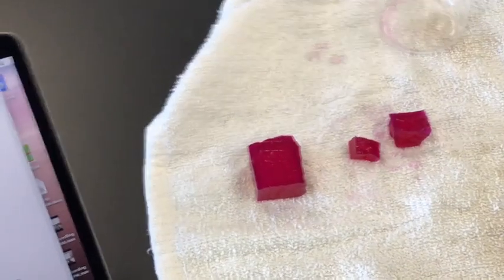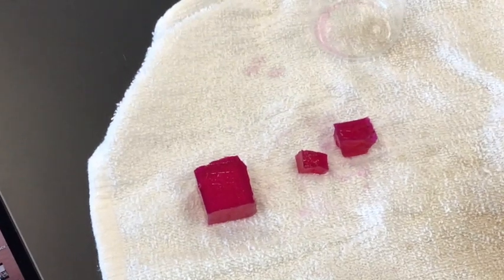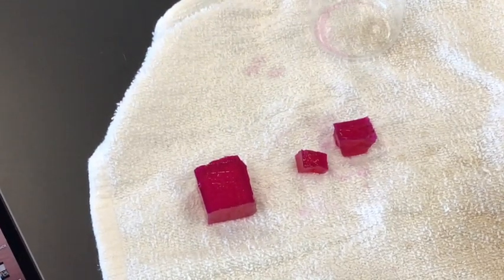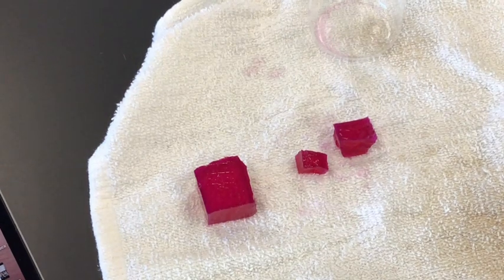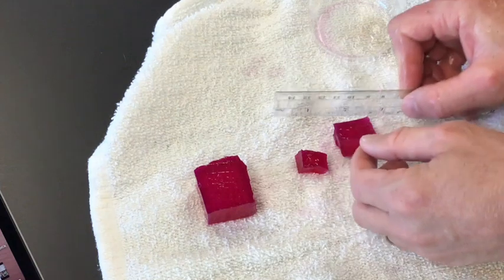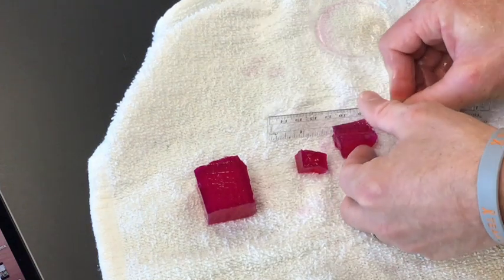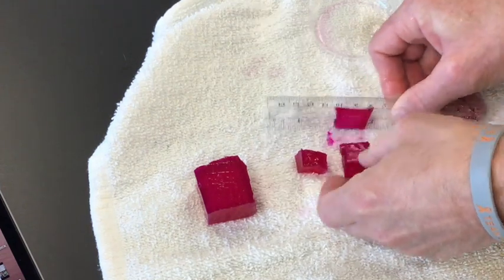All right, now the procedure says to rinse them very well, which I did, dispose the NaOH. Now cut them in half, so I'm just gonna use my ruler again and I'm going to cut each cube in half.